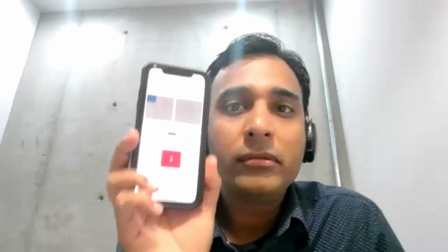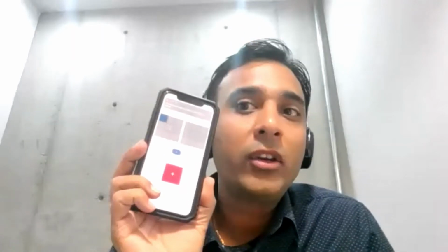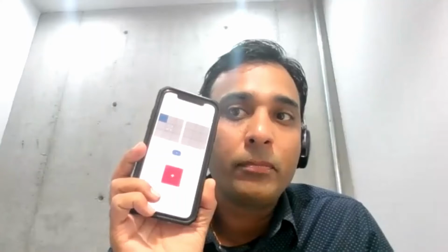Okay. So you are now seeing my screen. You have basically the Hemocytometer copy on your screen, right? This application is going to help you, as it is on your table when you are observing your hemocytometer by the microscope. Okay, so let's do one thing. This is going to be the second part, and we start from the first one.